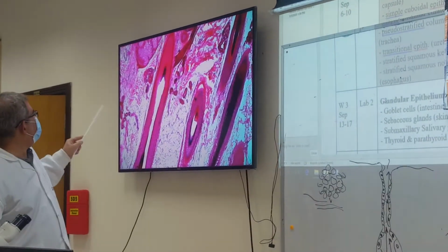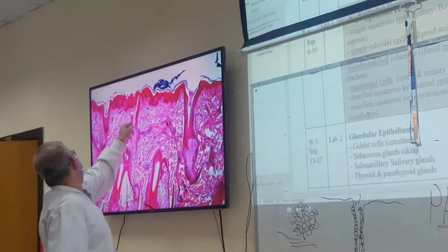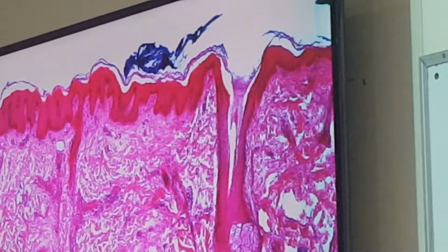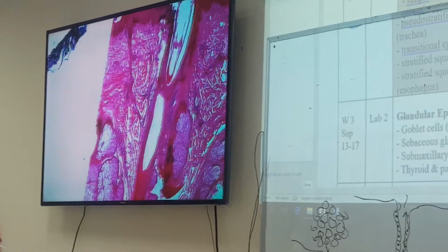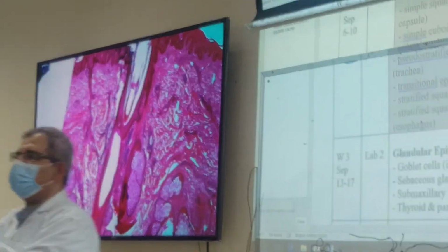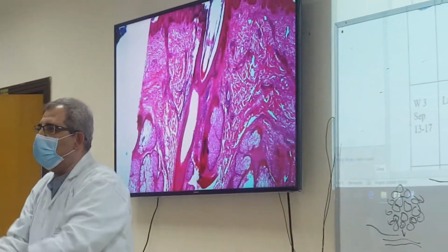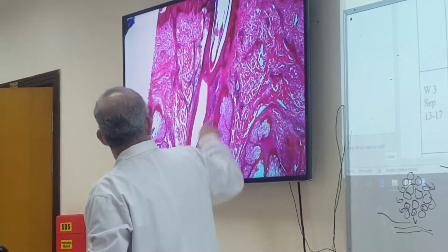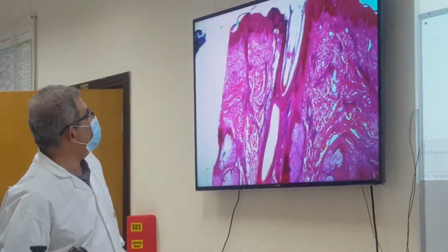Sweating glands, we can see them, but sometimes they might not be clear. And this is part of a sweat gland, but usually it got cut because of the sectioning. Is there any other one? This is another one, it's part. The problem with these sections is they are not really typical as you see in the textbook. It won't really show the whole duct.